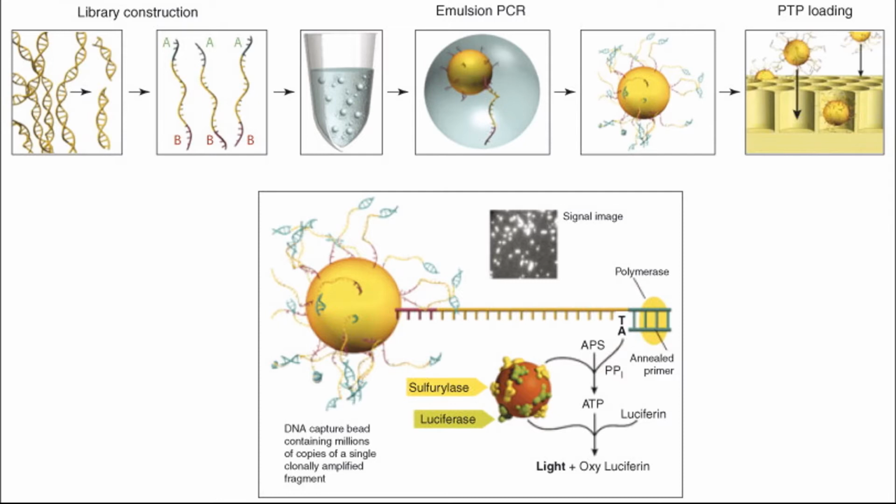Pyrophosphate generates signal upon addition of complementary nucleotide and is dark otherwise. When the signal is bright, it means that a complementary dNTP has been attached, and when it is dark, it means that no complementary dNTP has been attached. So this is how the 454 pyrosequencing method works.